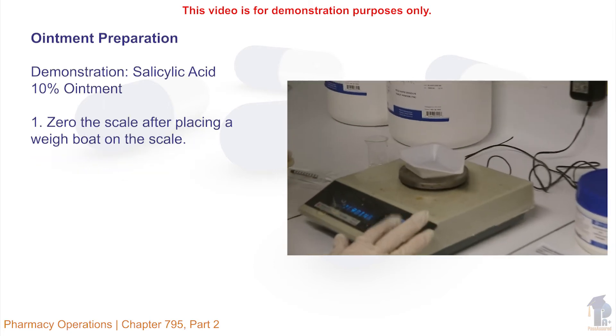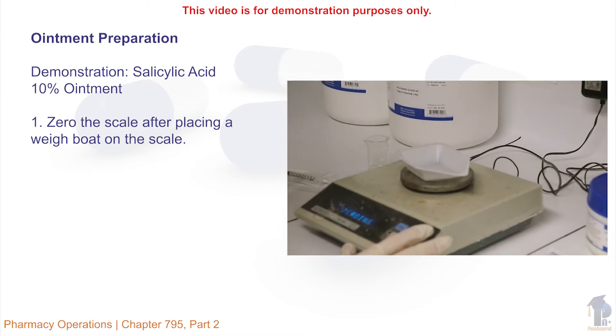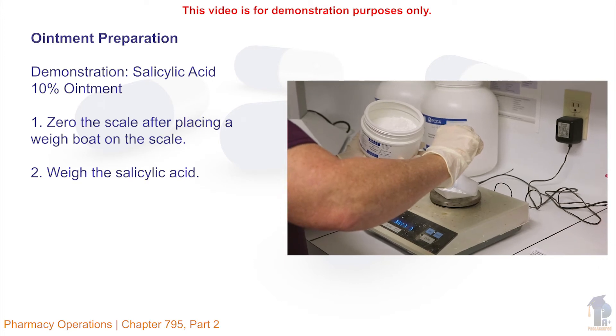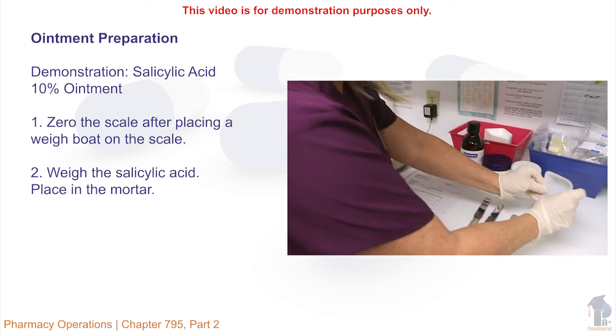First, zero the scale after placing a weigh boat on the scale. Then weigh the salicylic acid. Place in the mortar.